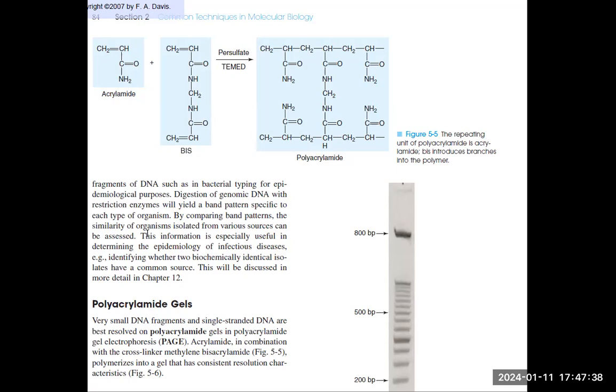A good example, guys, not for bacterial typing but for viral typing: right now, SARS-CoV-2 is best analyzed from wastewater treatment. They're no longer testing populations of humans, but they're testing wastewaters coming from homes and communities, and those will surely reflect if there's an emerging variant, if there's a difference in their band patterns. So what is the methodology that they're using? They're using pulse-field gel electrophoresis.